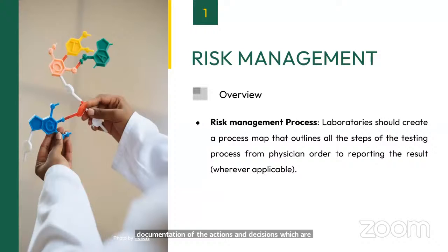Risk management process. The next concept in risk management is the risk management process. The laboratory should create a process map that outlines all the test steps of the testing process from physician order to the reporting of the results wherever possible. Now, many times I get questions on how to perform the risk management, how to assess the risk.